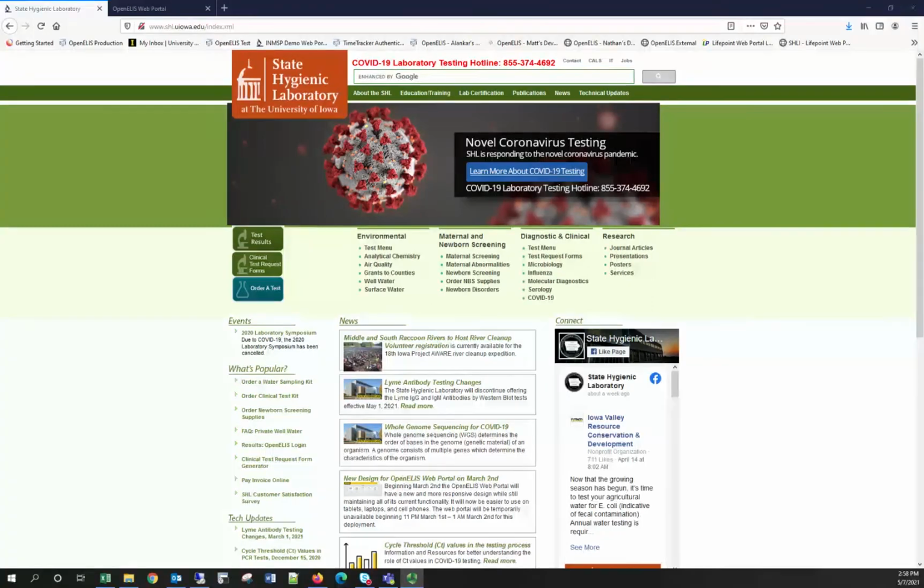This tutorial will show you how to use the OpenELIS Web Portal. First, go to the State Hygienic Laboratory at the University of Iowa's website at www.shl.uiowa.edu.